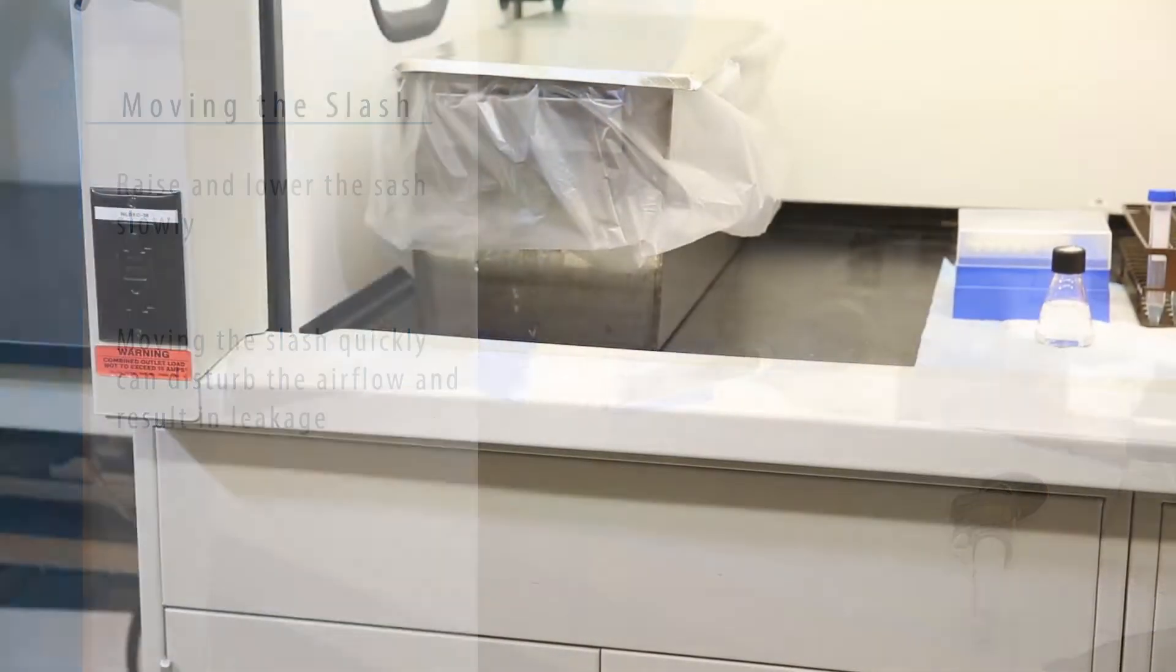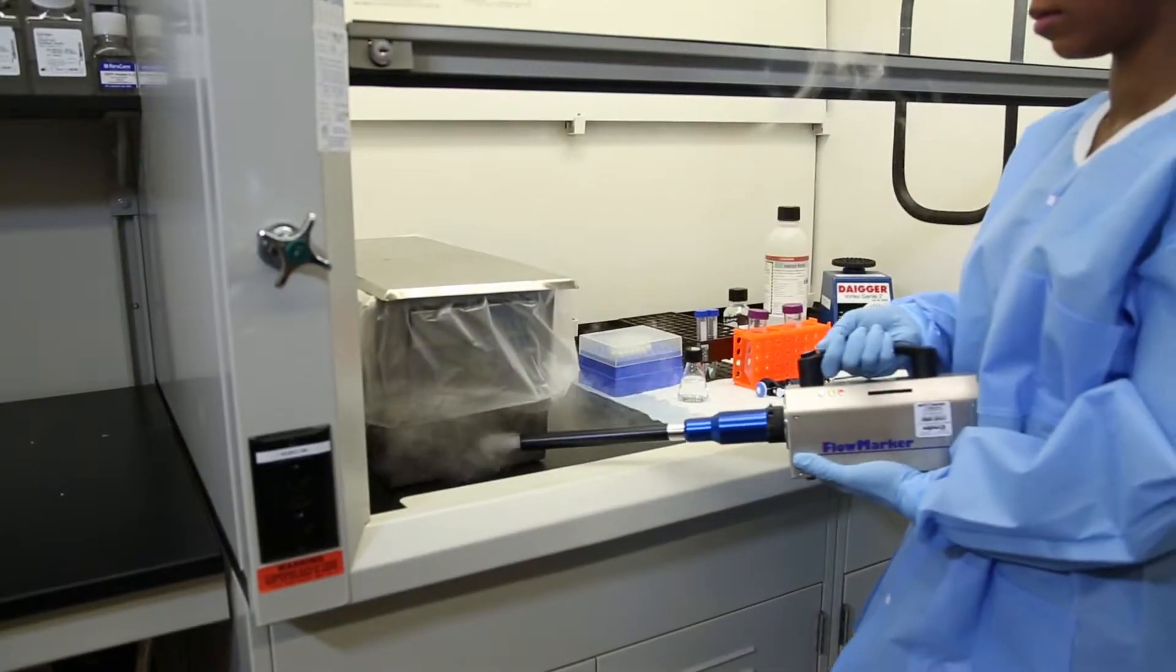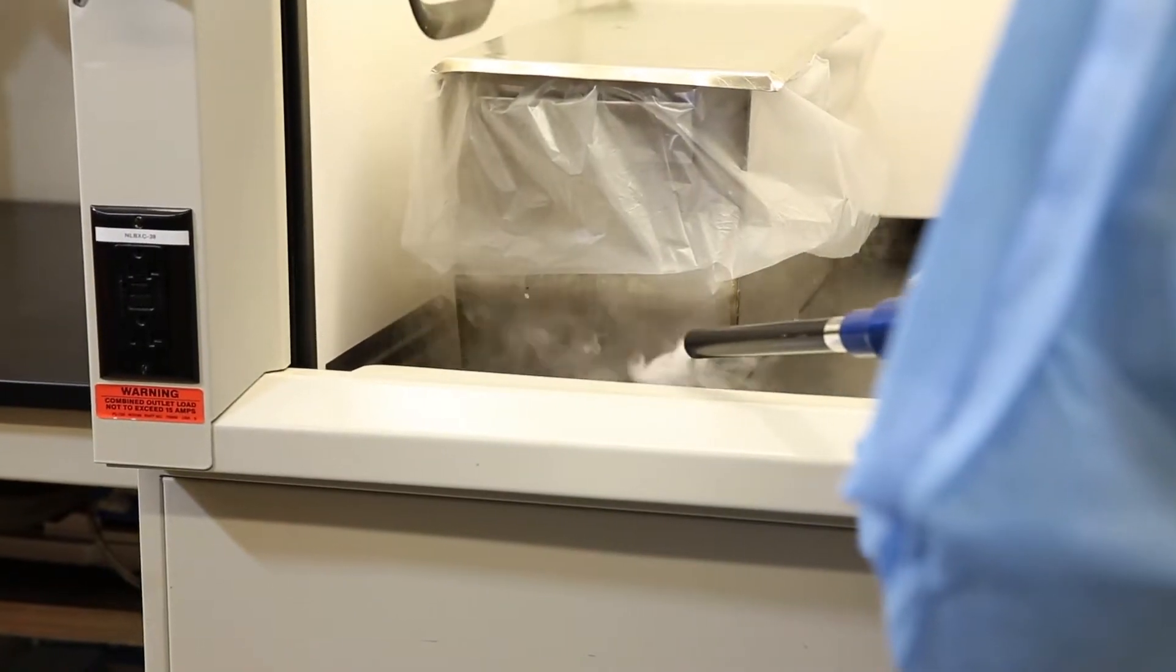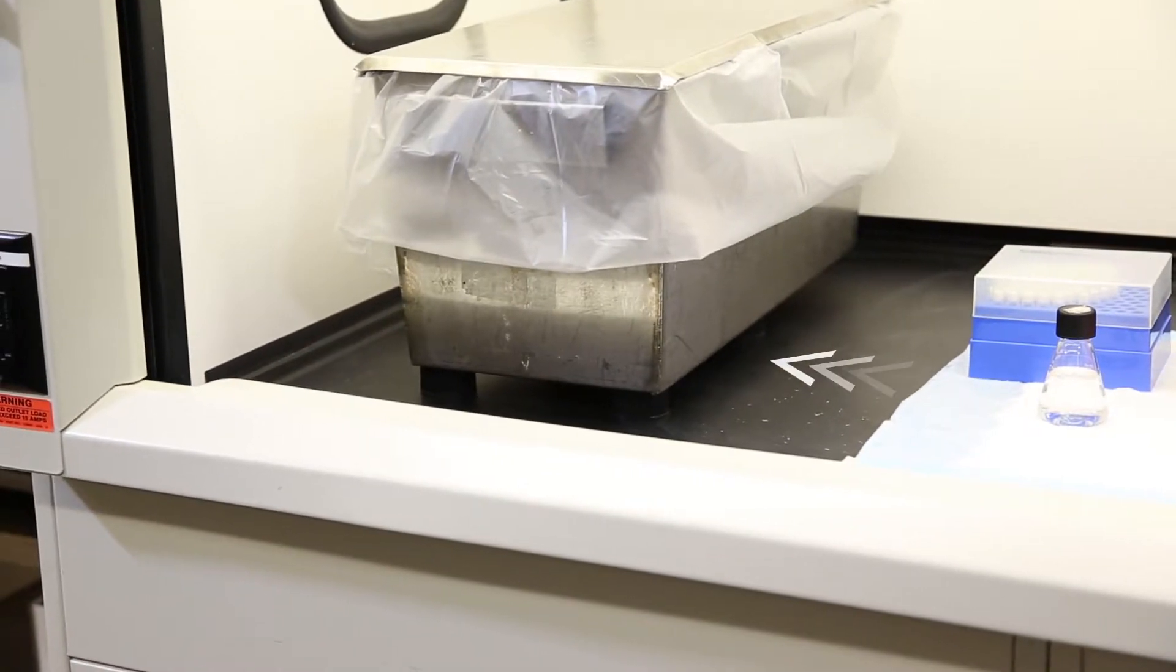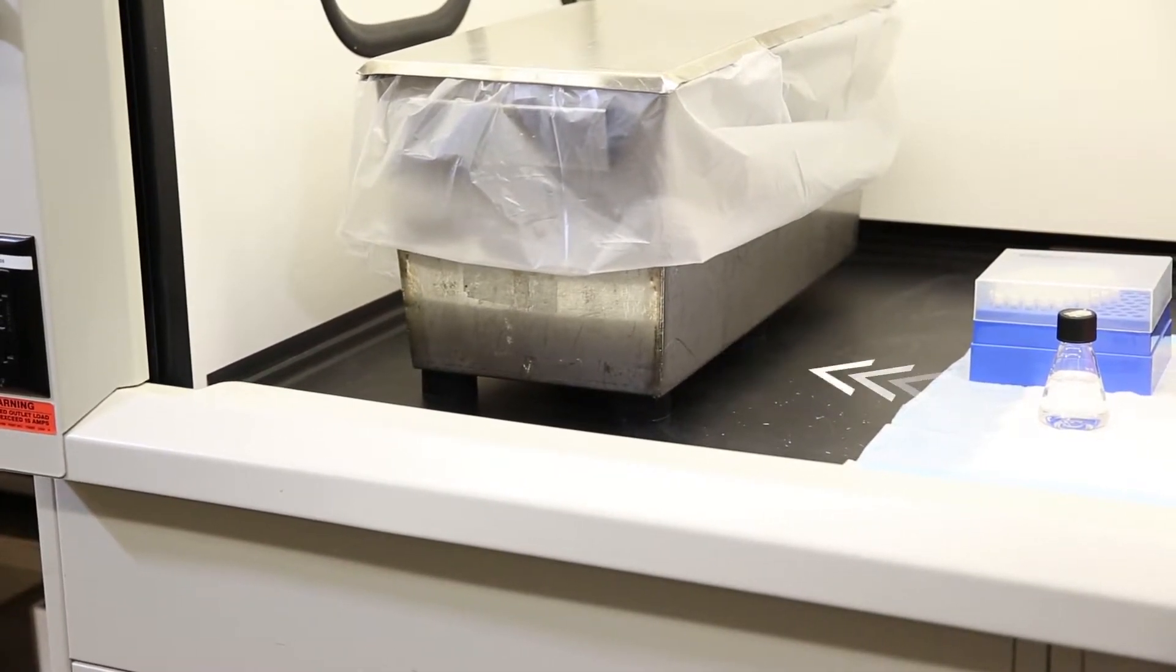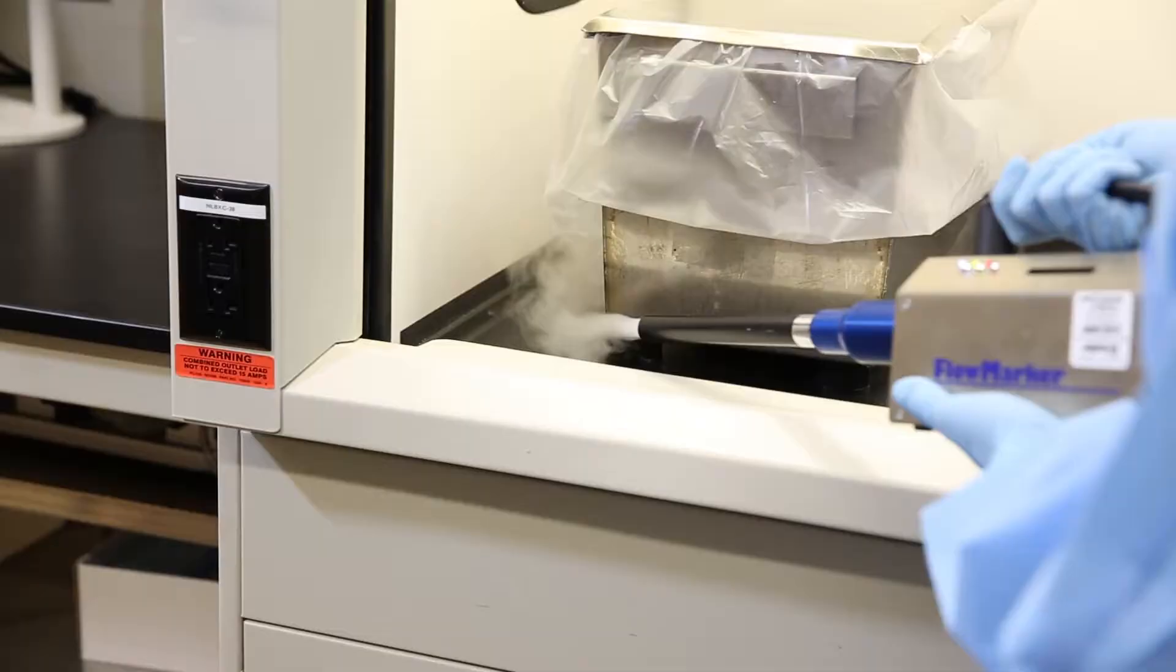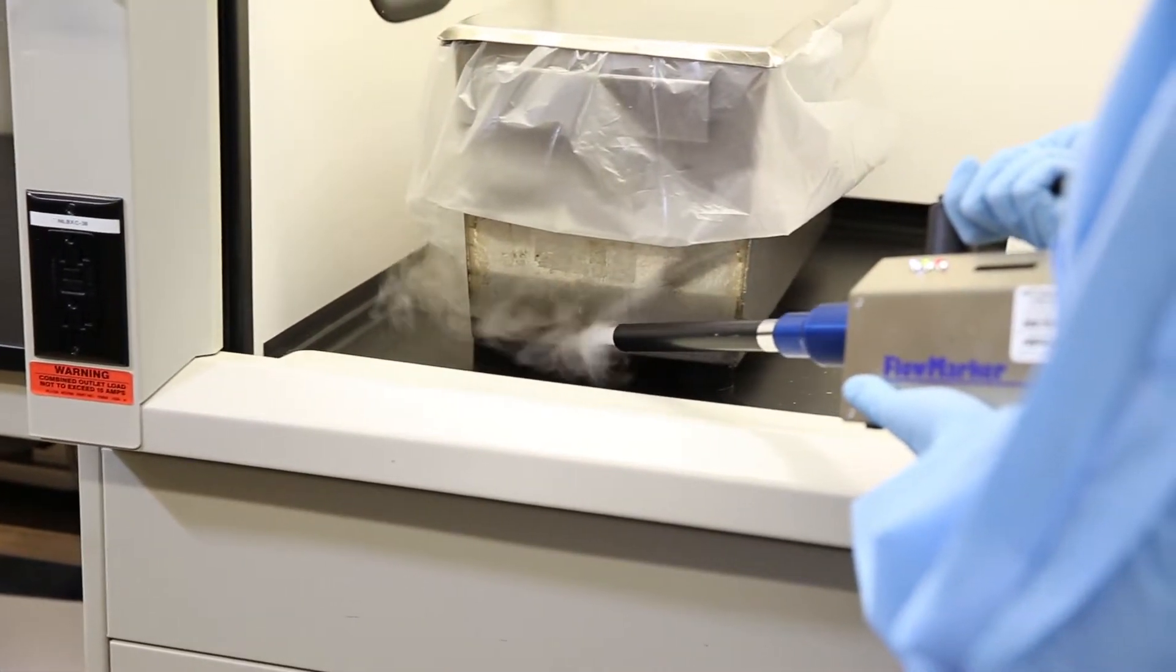Large equipment inside the hood can obstruct the airflow and may allow vapors to escape into the lab. Equipment should be elevated to allow air to flow under it so the proper fume hood airflow patterns will be maintained.